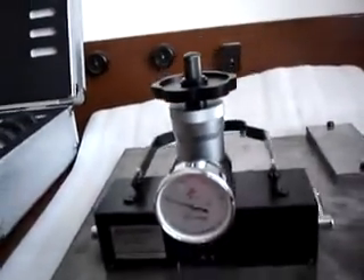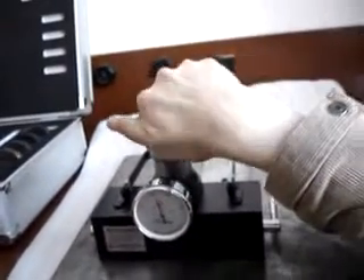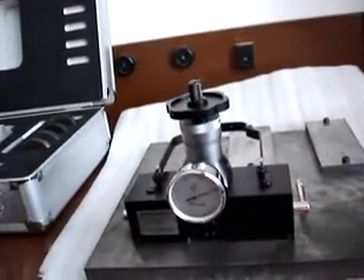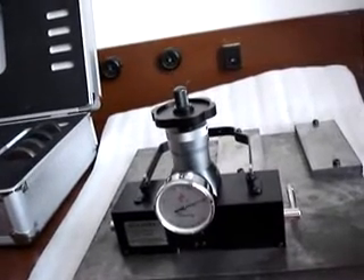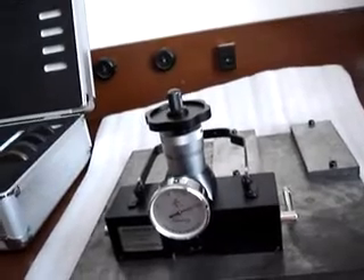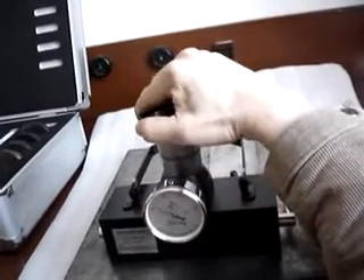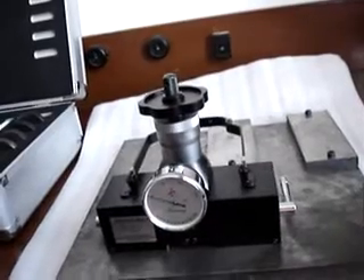And then, apply and remove the main test force. Successively and steadily rotate the hand wheel clockwise to bring the indicator hand to the total test force — for example, 150 kg. After applying the total test force, the main test force should be completely removed within two seconds, and the indicator hand should be brought back to the initial test force of 10 kg.